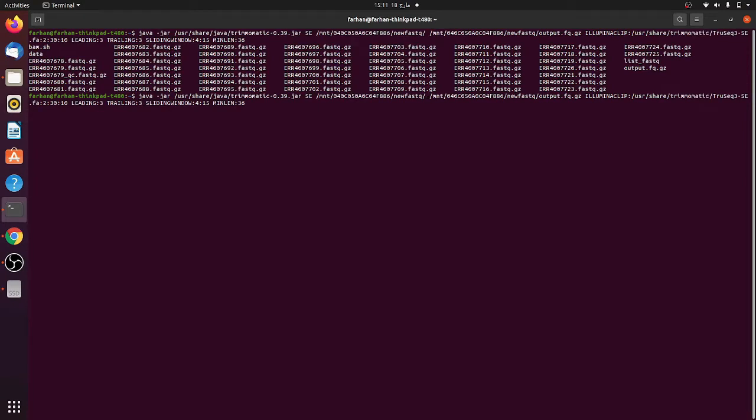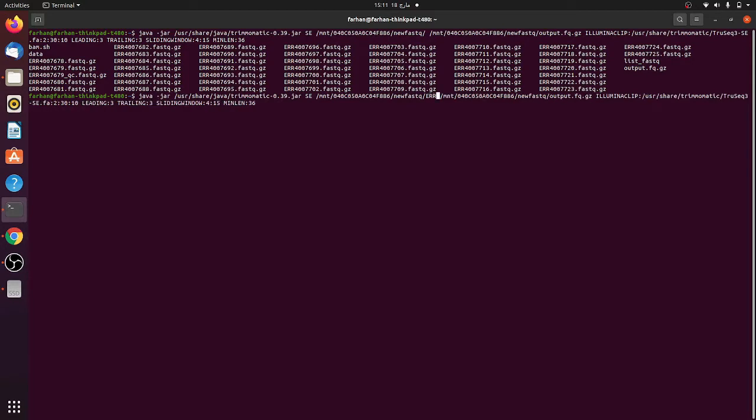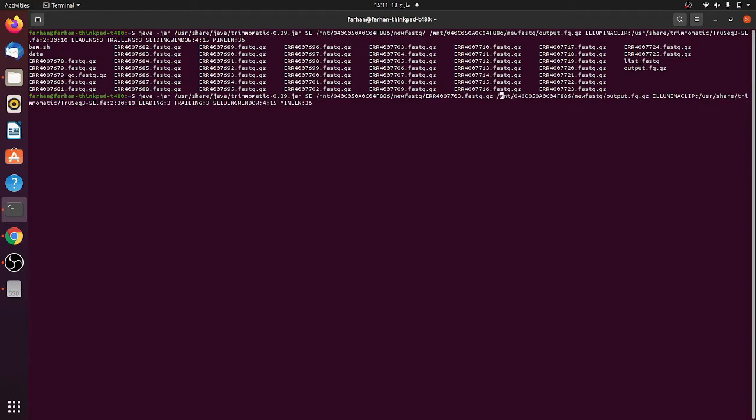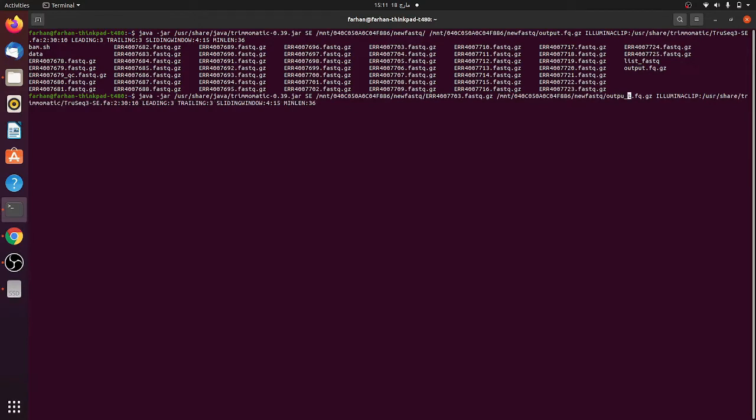You can put any of those files here. For example, err4007703.fastq file. This is the input sequence FASTQ file which we want to trim. The next one is the output file. Here you can write output file or output new.